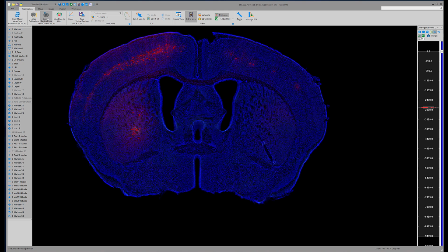The first part of the section registration requires an atlas calibration, which is a simple thing that adjusts the dimensions of the experimental sections to the Allen space. It depends on what tool or method is used to cut the brains, since everybody cuts brains.